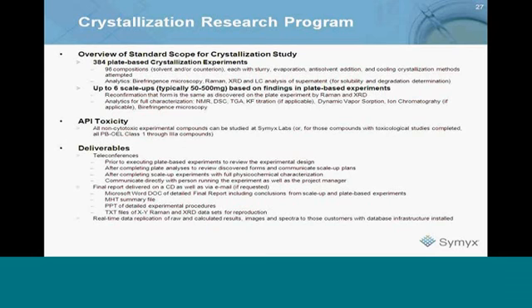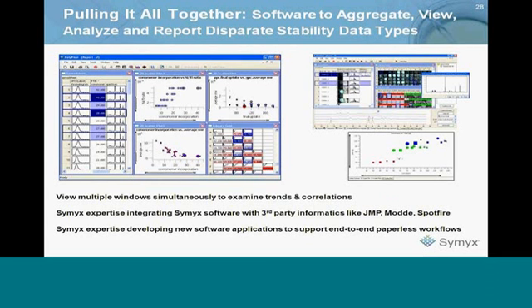So this is actually the last slide I have, and then I can open up and take some questions. So really the idea is to pull it all together and to use software and the informatics to wrap around and enable not just the automation, but really to take advantage of the fact that in the area of crystallization, you want to rely on more than one piece of analytics. We aren't relying on just X-ray or just Raman or just birefringence, but really tying that all together. That can become quite cumbersome without the ability of really having an integrated workflow to pull all the data together, to generate it all, and be able to rapidly and easily generate reports to be able to make decisions.